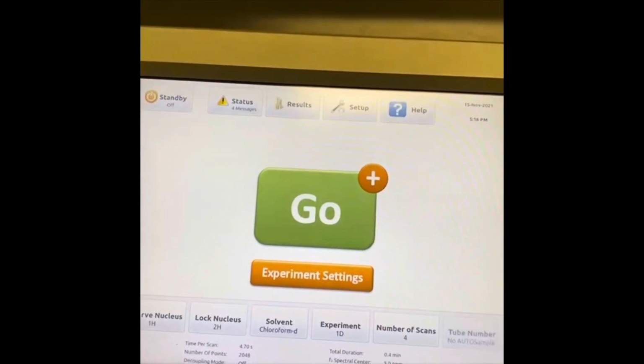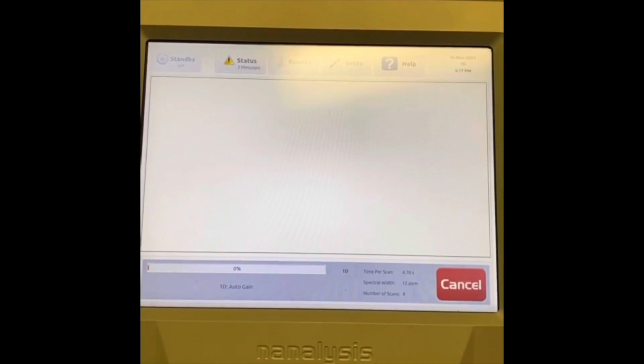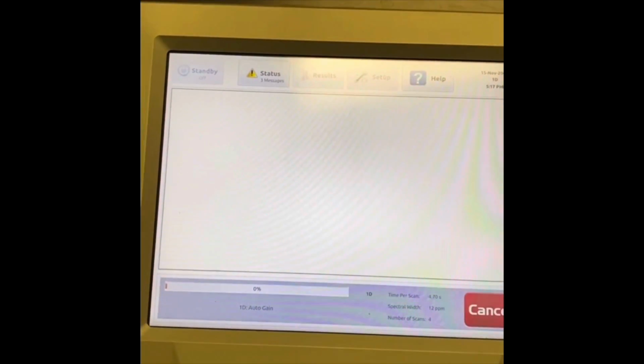Next, Dr. Jonathan showed us some things that we may see in the organic chemistry lab as well. On today's menu, we have NMR spectroscopy. I know earlier that you guys had IR with DJ, but this is something new and even better. So let's get right into it. Here, Dr. Jonathan is showing us how to use the NMR machine and also explaining how to read its data.